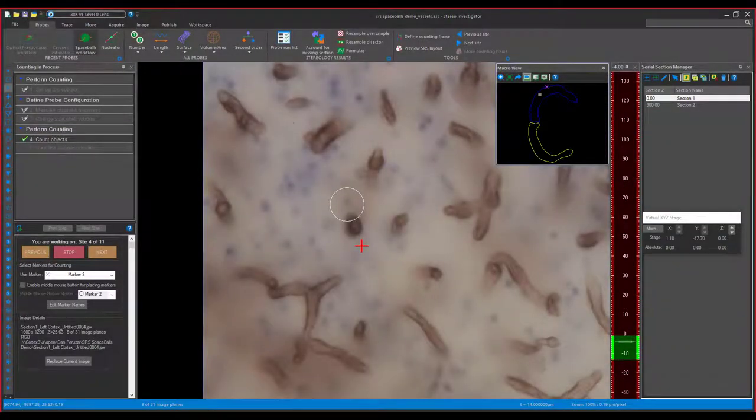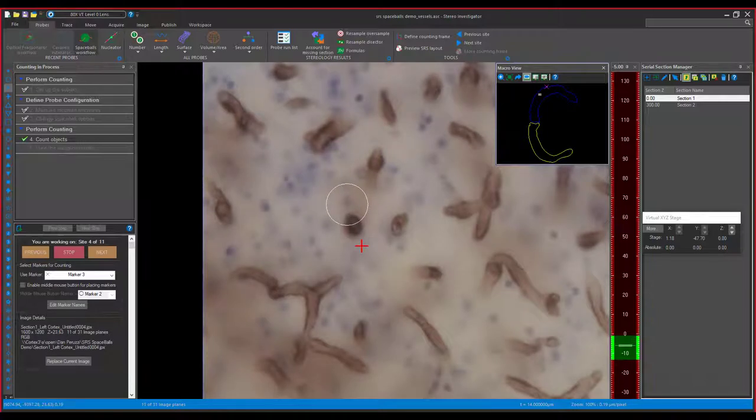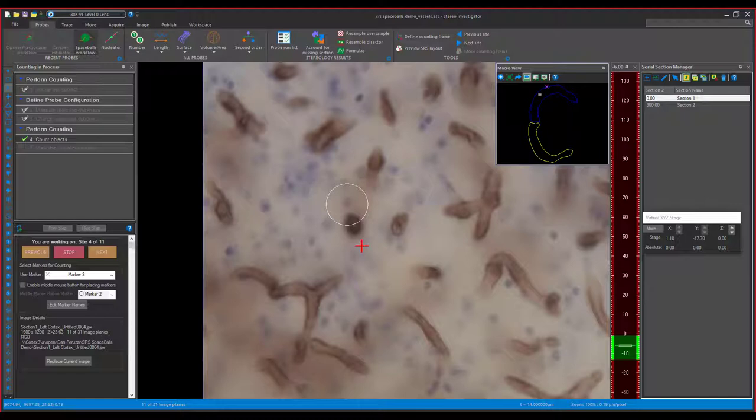And finally, we have Spaceballs. Spaceballs is a stereological probe used to estimate the total length and length density of fibers such as dendritic branches and capillaries in any region. It works by placing a marker when the middle of the dendritic branch or vessel touches or crosses the plane of the sphere or hemisphere.